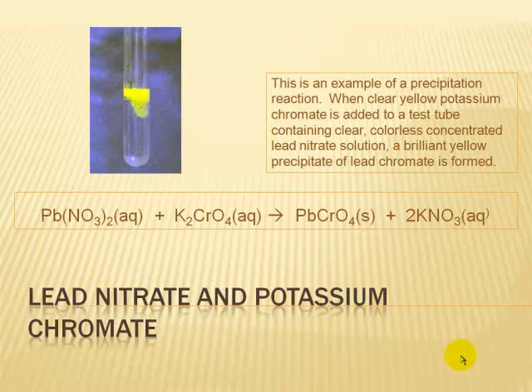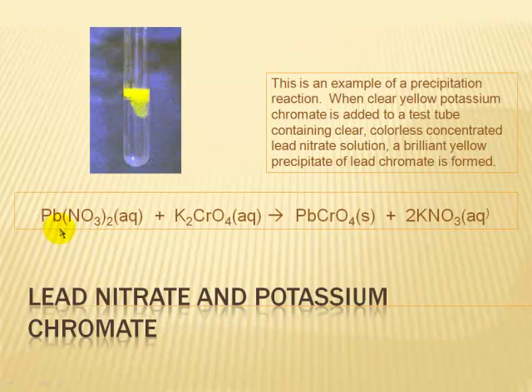The first type of reaction was electrolysis. The second type we're looking at is a precipitation reaction. When clear yellow potassium chromate is added to a test tube containing clear, concentrated lead nitrate solution, a brilliant yellow precipitate of lead chromate is formed. The equation is: lead nitrate plus potassium chromate gives lead chromate — the solid precipitate — and an aqueous solution of potassium nitrate.